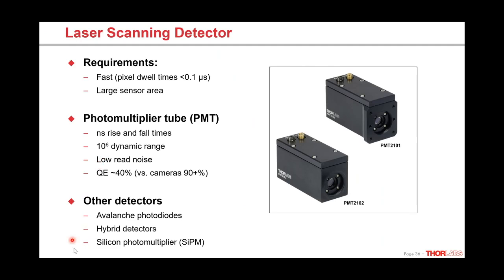So a third possible detector that's being worked on is the silicon photomultiplier. These leverage the large development in CCD technology that's come about in the last 5 to 10 years to try to put together a high-speed multi-pixel detector that could be used in this type of setting.